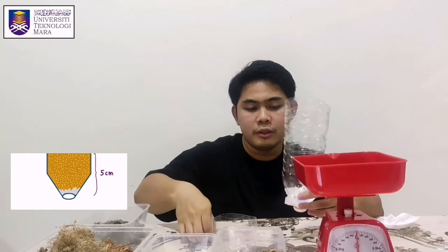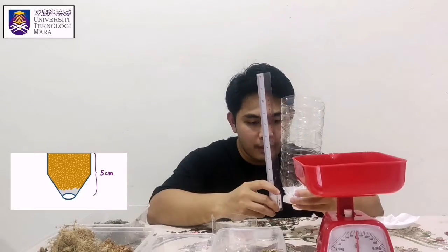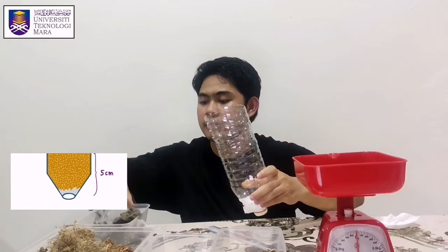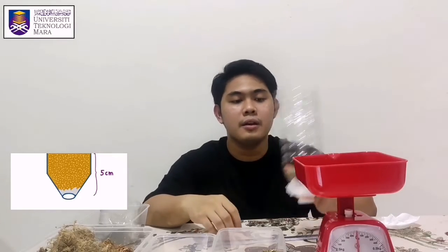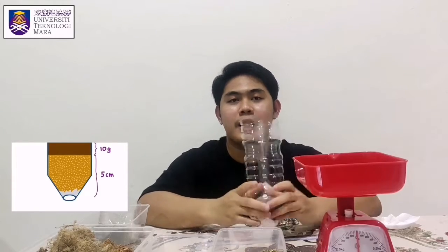So basically we need to measure first, and we will estimate 5 cm. Okay, so this is 5 cm of sand. So basically the next step is we're going to put 10 grams of the coconut husk.